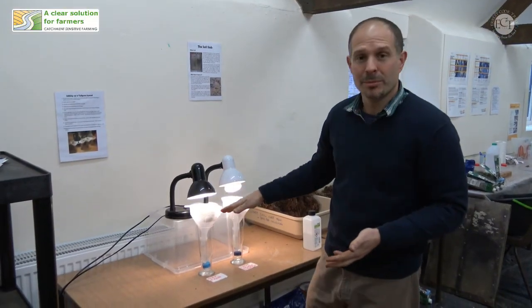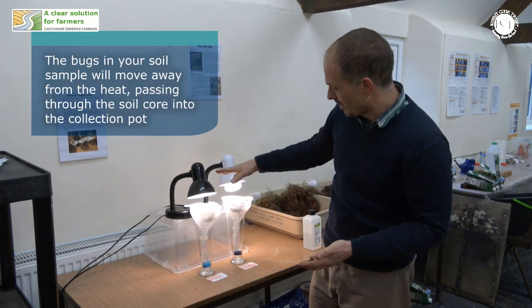What the animals will be doing is moving away from those things — down through the soil core, through the mesh, and into the collection pot.